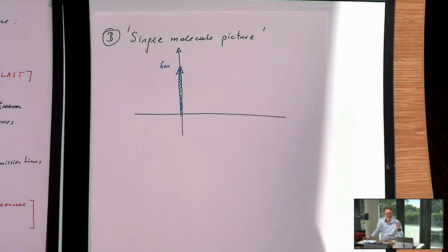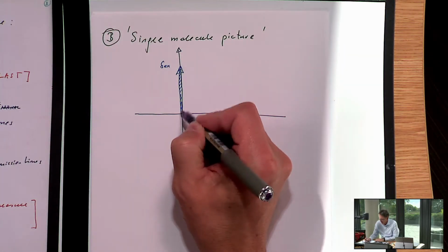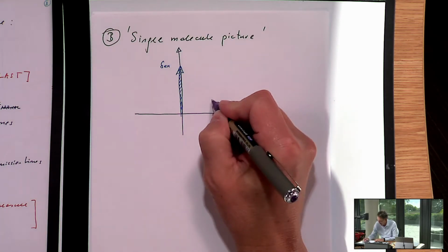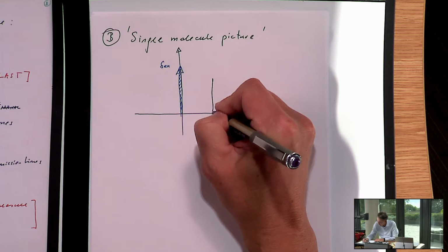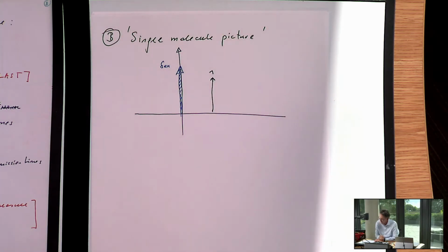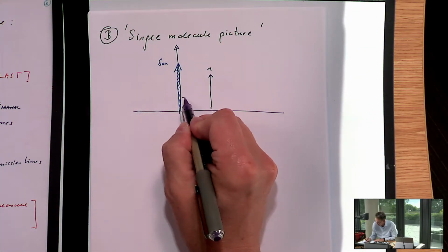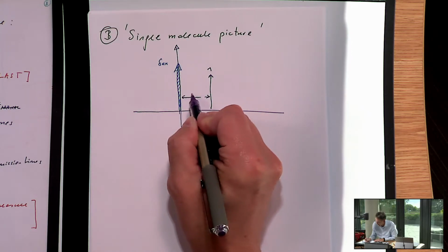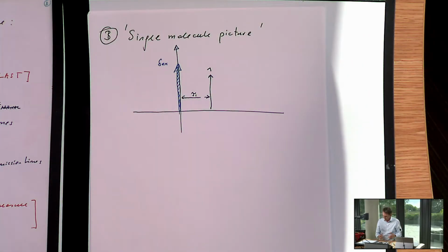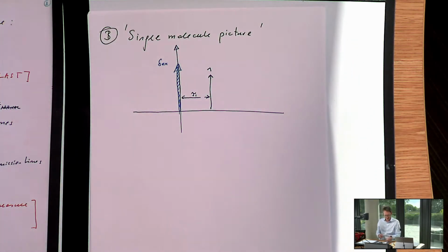One photon can only come out at a particular time. So let's just do this. Let's put the pulse in, we excite the molecule, and we now wait, and perhaps after a time t1, we get a photon, the first photon coming back. I put one pulse in, I wait, and then after a delay tau1, a photon comes back. All right, I don't know exactly when it comes back, but it will be within a certain time period.